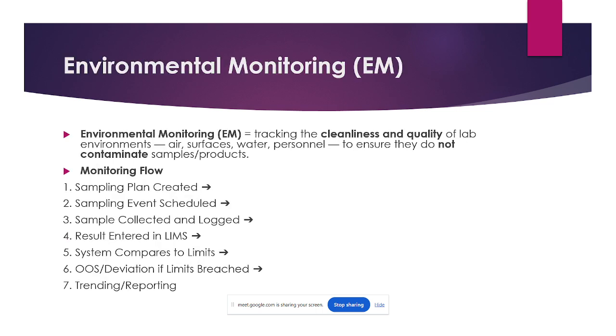And then coming to environmental monitoring, it majorly tracks lab cleanliness and also some of the manufacturing sites. Majorly water is used for the manufacturing site, so that water we are testing.